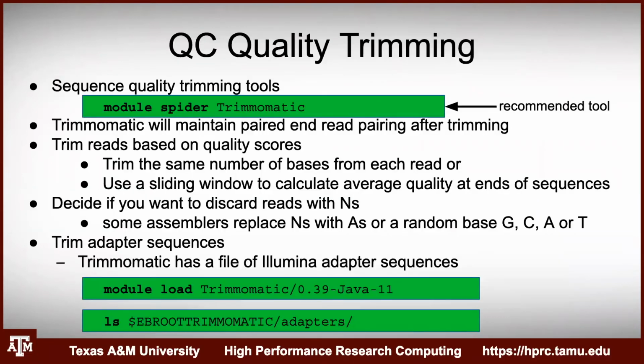All right, so like I said, whenever you get your data back, it really varies on the lab, and sometimes within the lab, on whether or not it's been trimmed, what the data looks like. So there are tools available to trim. You can trim for both adapter content and for quality. Like I said, trimming does have some major implications for mapping rates and things like that.